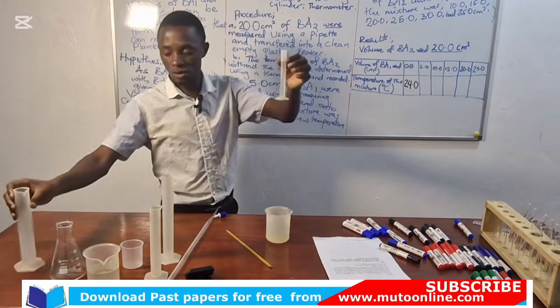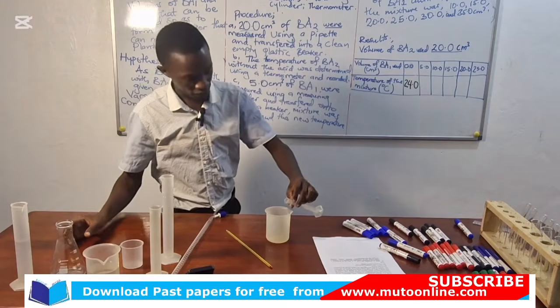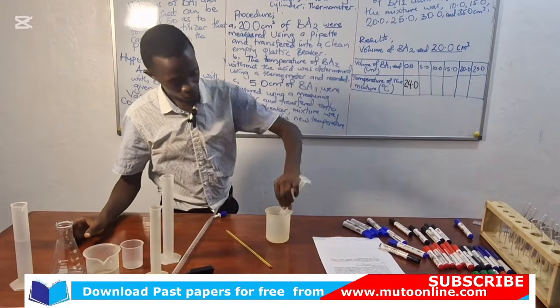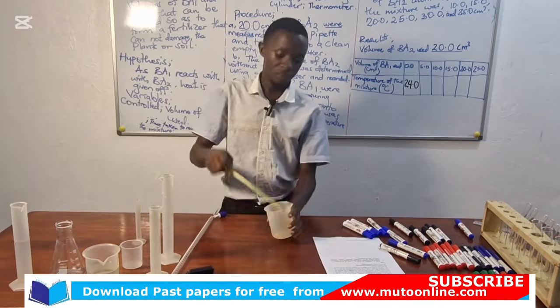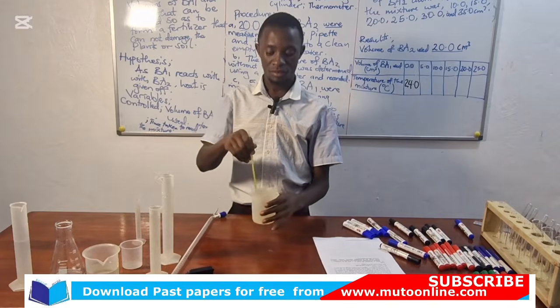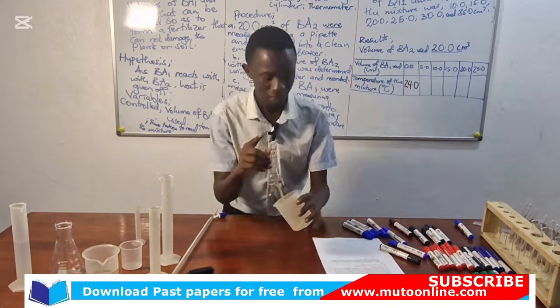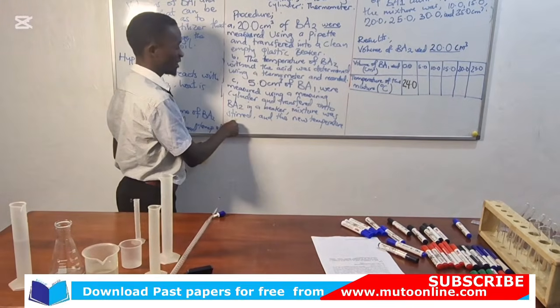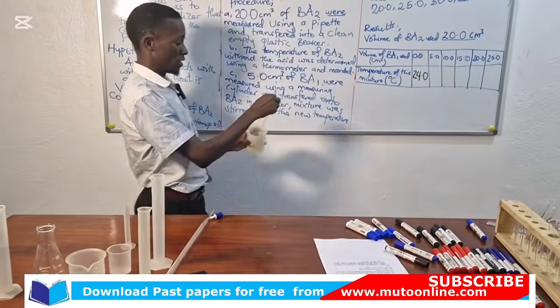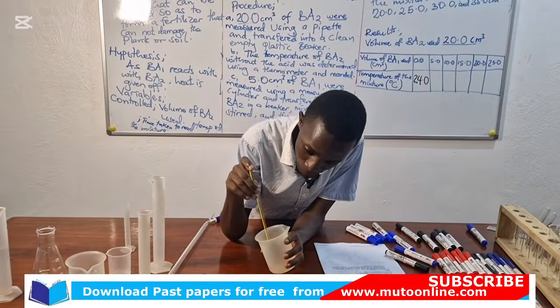So this is my 5 cubic centimeters of BA1. I'm transferring it into BA2 in a plastic beaker. Stir the mixture gently using a thermometer, because stirring is part of the procedure. And I'm going to give it time for the reading to be stable.